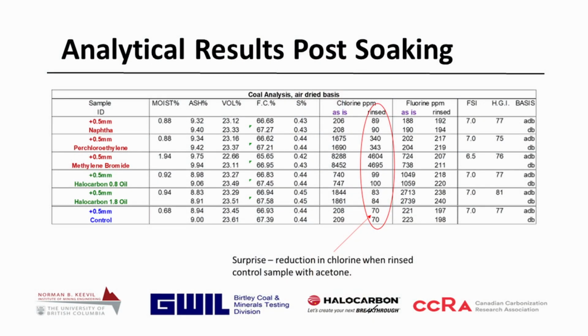Anybody who sells coal or wants to sell coal into China, it's critical that you understand your trace elements. There's 5 of them right now since January 1st, 2015, that have been flagged by the Chinese government. And if you don't pass their criteria, your cargo could get quarantined. In this test here, we tested chlorine and fluorine. The other 3 would be phos, mercury, and arsenic.